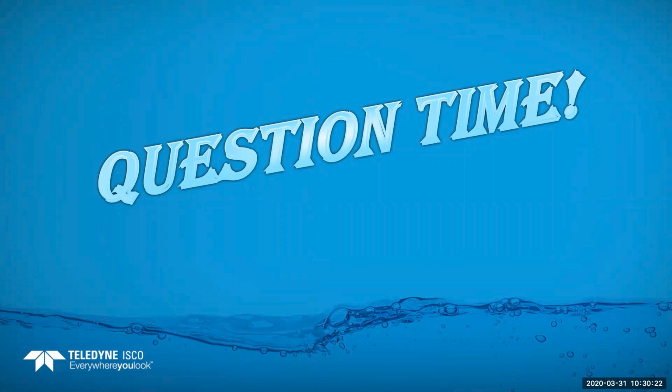Ryan asks, what kind of enclosure would you recommend for a permanent site to help mitigate vandalism? Usually some type of cover over it, like a little shed or something that you can lock the door on. They can sit outside, but again, vandalism and stealing do happen. Most of the refrigerator-type samplers do come with locks, or you can padlock the door so they can't get in there.